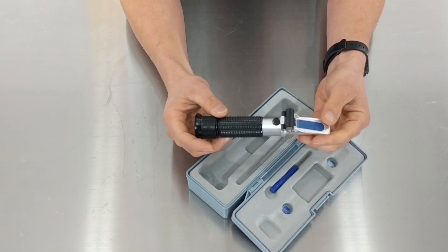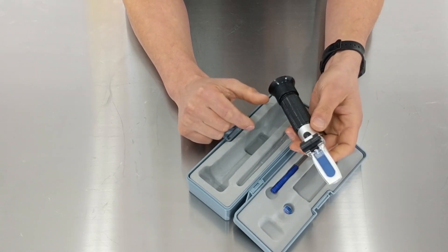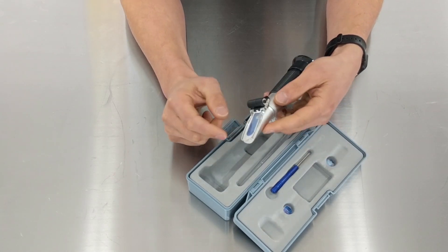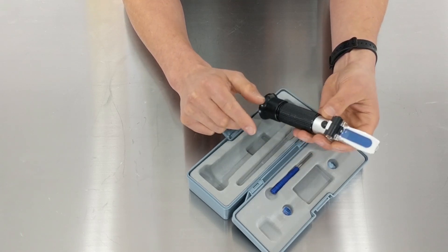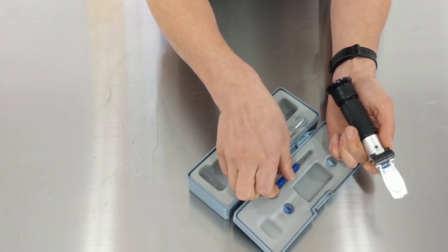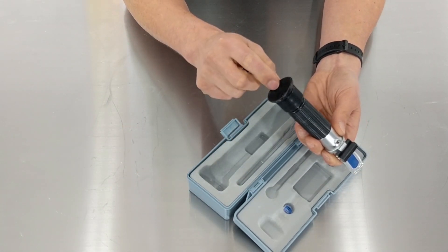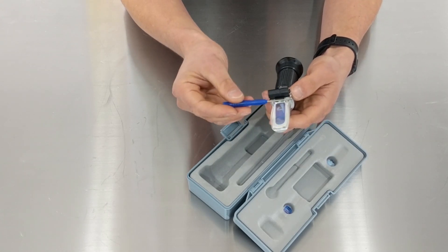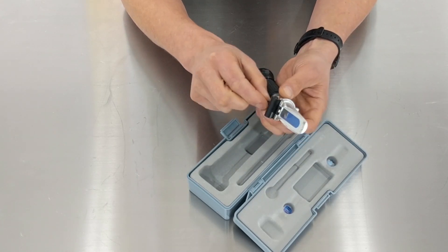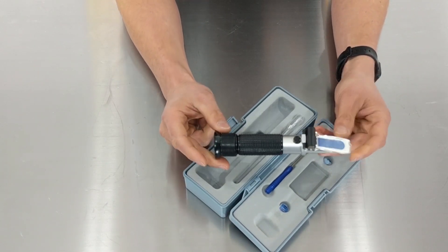When you first get it, it'll generally be more or less calibrated, but you might want to do some calibration with distilled water. Just pop a little bit of distilled water on the lens, shut the lid, take off the cap, and with the included little screwdriver you can adjust it. While looking through the lens, adjust until you get a zero reading, then put the cap back on. The calibration is pretty straightforward.